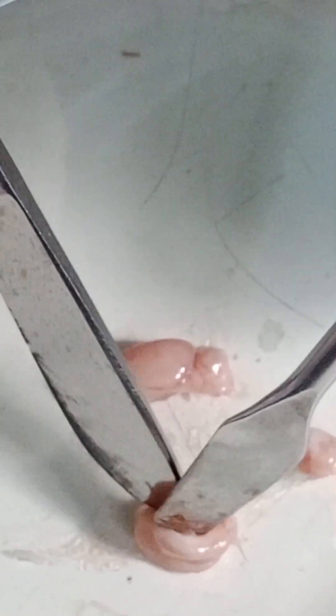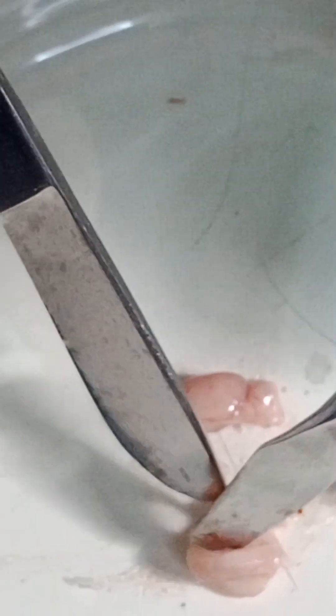Here I am removing the hypothalamus, thalamus, and olfactory cortex, because behind these three structures there is the hippocampus. The hippocampus is the part of the brain that deals with memory function.